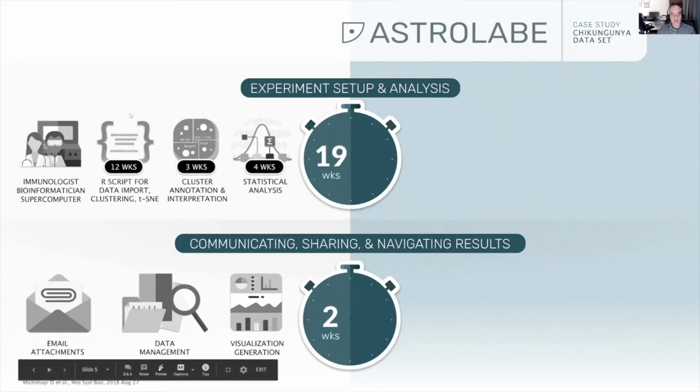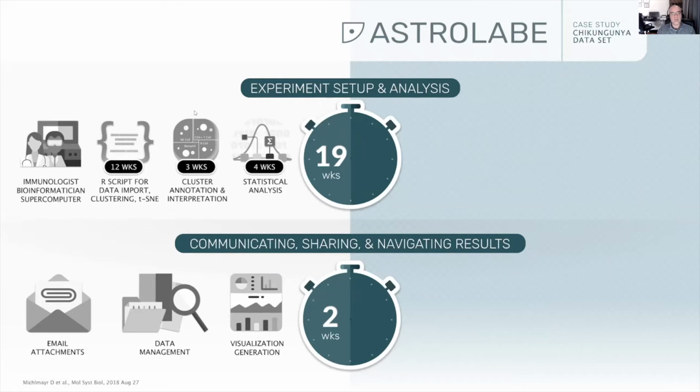And this factors in writing R scripts for importing data and clustering it and running t-SNE, annotating clusters, doing the statistical analysis, and sharing all of these results across the team. So just to recap, there's a bunch of amazing tools out there if you're an expert on the bioinformatics and if you have the time, the bandwidth, and the computational power to deal with the data.